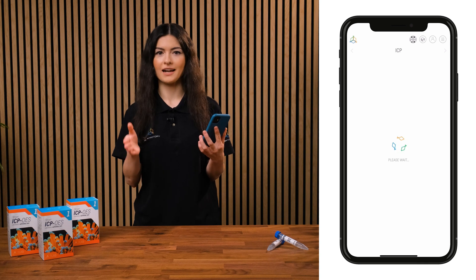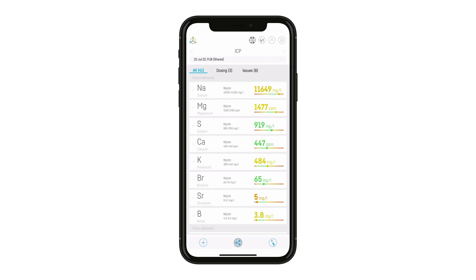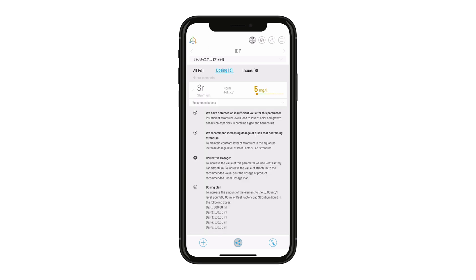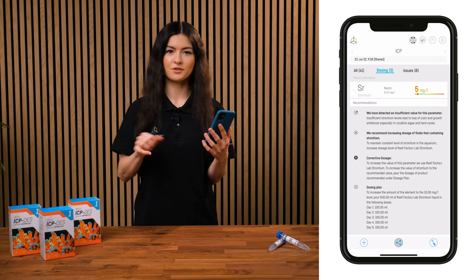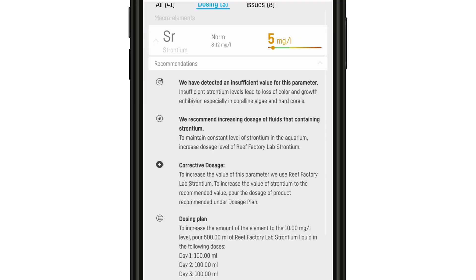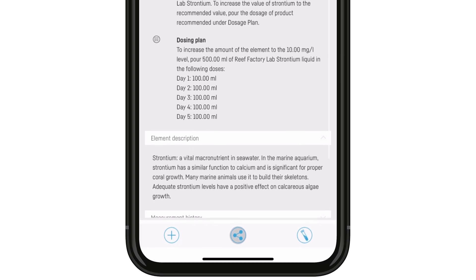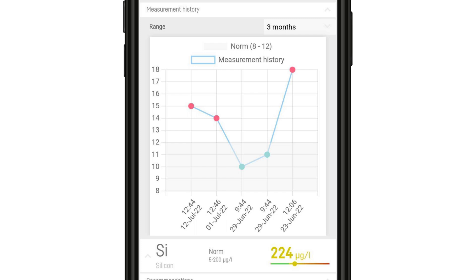Or you can also check them by logging in at reeffactory.com. There, we can access the ICP test results presented on a clear scale. The measurements are categorized into three tabs: the All tab, where you can find all parameters along with the results; and the Dosing tab, where we can find micro and macro elements with their concentrations which require additional supplementation. Under each of the elements there are Recommendations, where we can find information on what exactly a certain deficiency might cause, and how many doses of which elements should be supplemented so that the parameter is in the optimal range. There is also a description of an element and information on what it is and what it is responsible for, and Measurement logs to facilitate tracking of the changes.